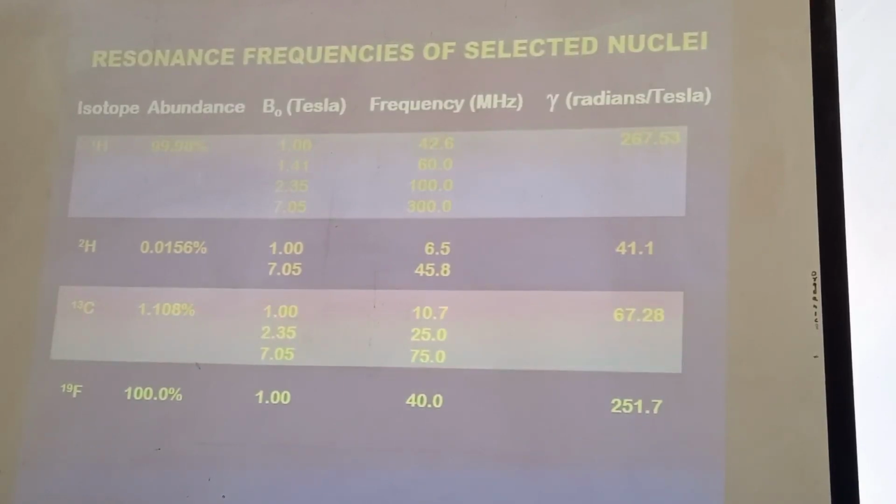So as to have 99 carbon-13s, जिस तरह प्रोटॉन में था, प्रोटॉन में तो 100 में भी आपको 99 मिल रहा है. So as to have 99 carbon-13s, you can count the number of molecules that you need for that. So to bring the signal intensity at par with proton, the molecules for which you want to see carbon-13 must be higher in number.